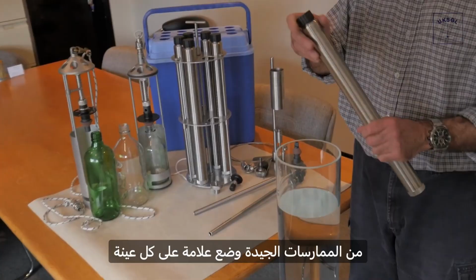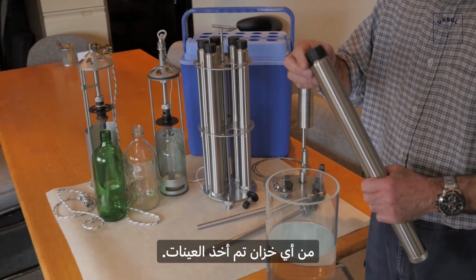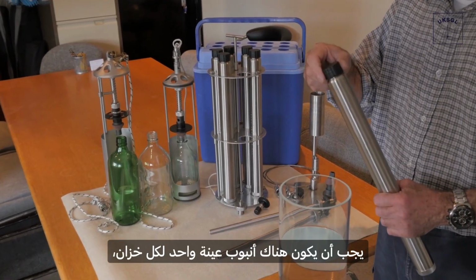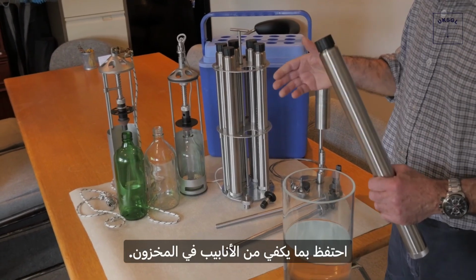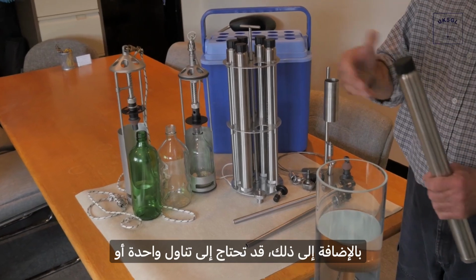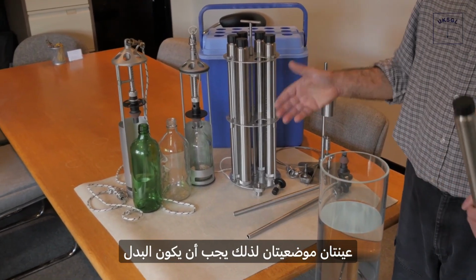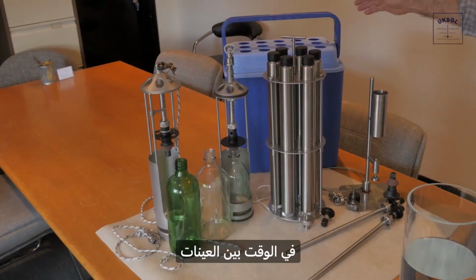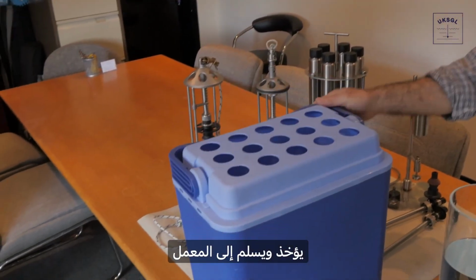It's good practice to mark each sample tube with a label to show which tank the sample is from. There should be 1 sample tube per tank, so you should ensure you hold enough tubes in stock. In addition, you may need to take 1 or 2 spot samples, so an allowance must be made for extra sample tubes.